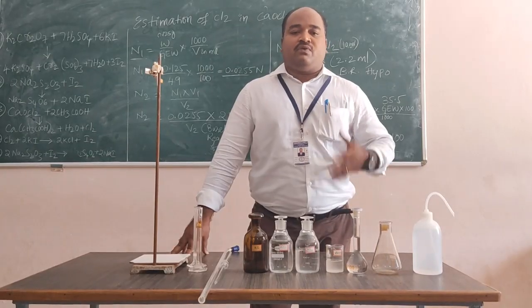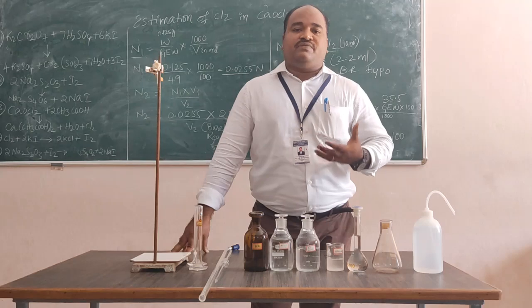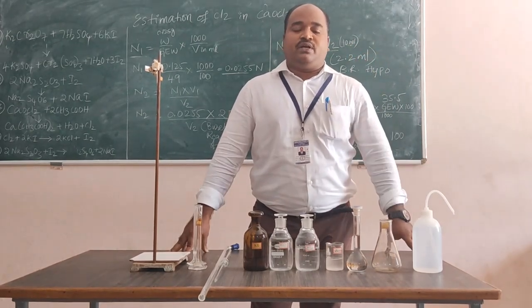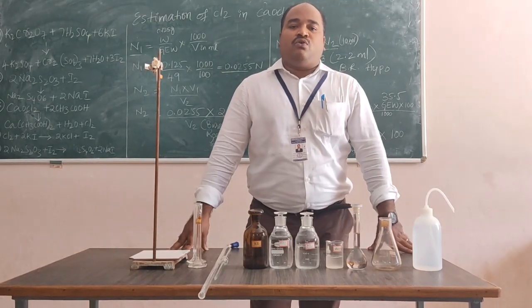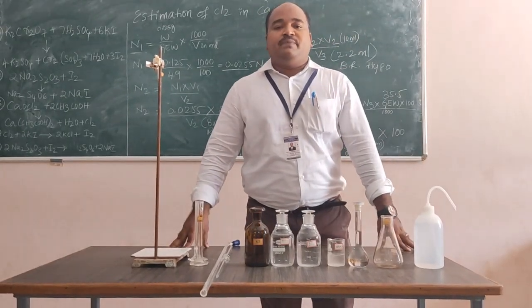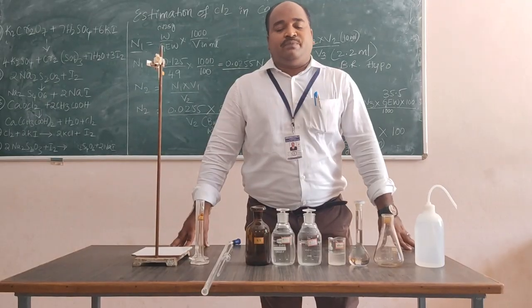If we still feel that there are some microorganisms contaminating our water, we need to add some bleaching powder into the water. There, calcium oxychloride will liberate chlorine, and the chlorine kills microorganisms. Today we will estimate the percentage of chlorine present in bleaching powder.